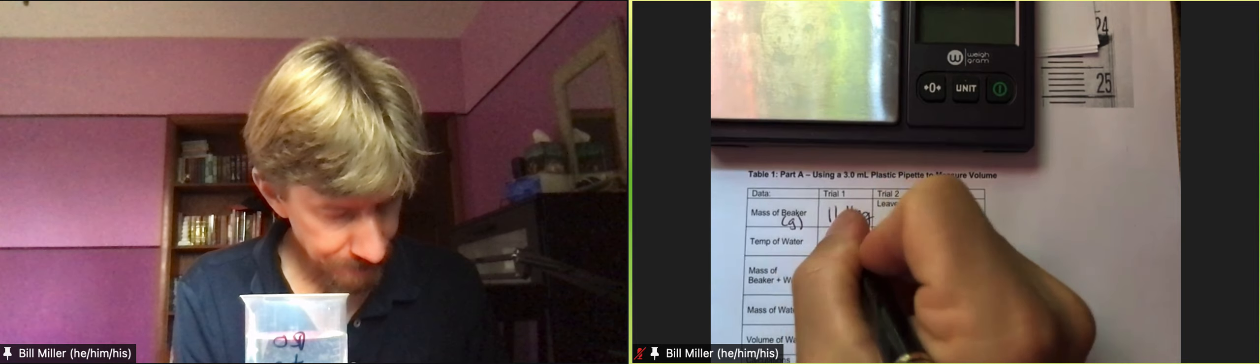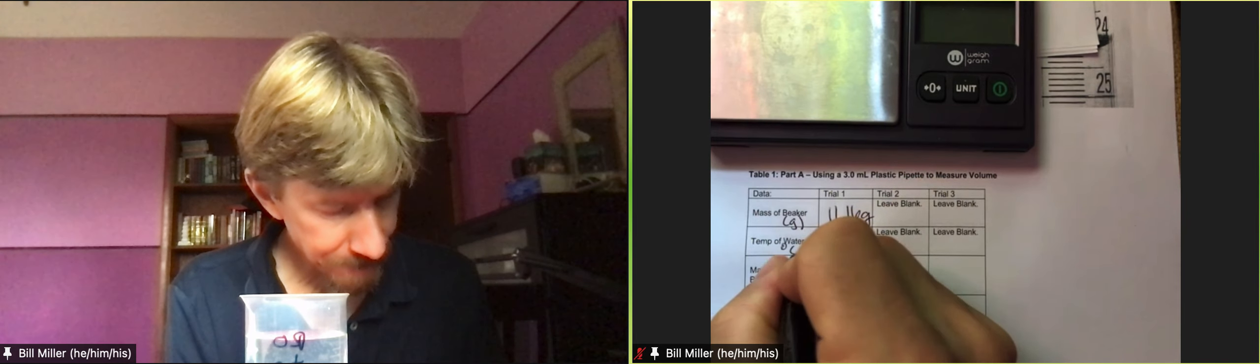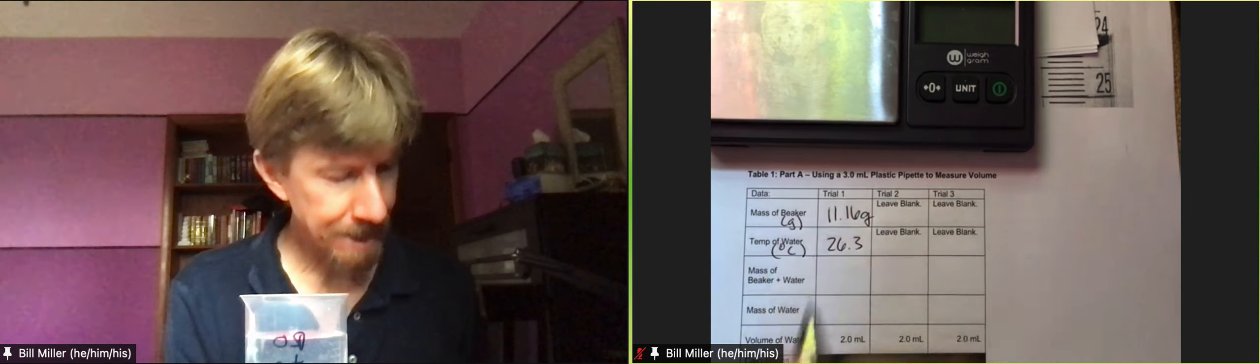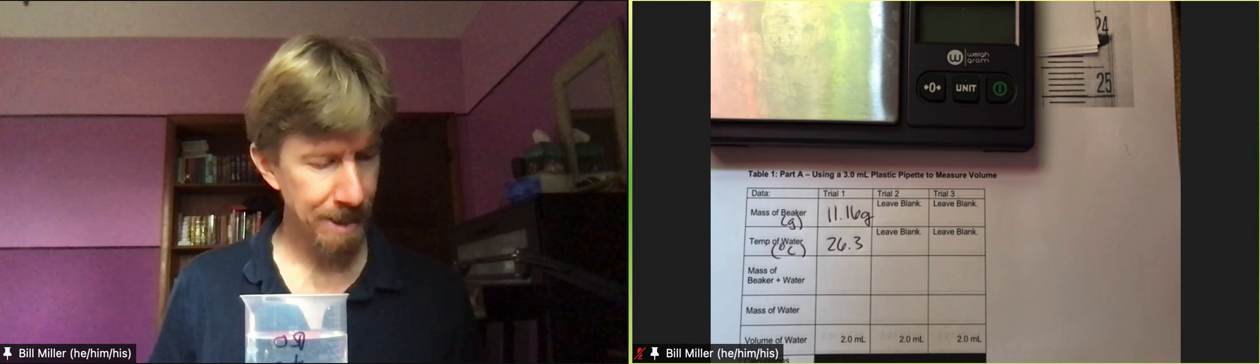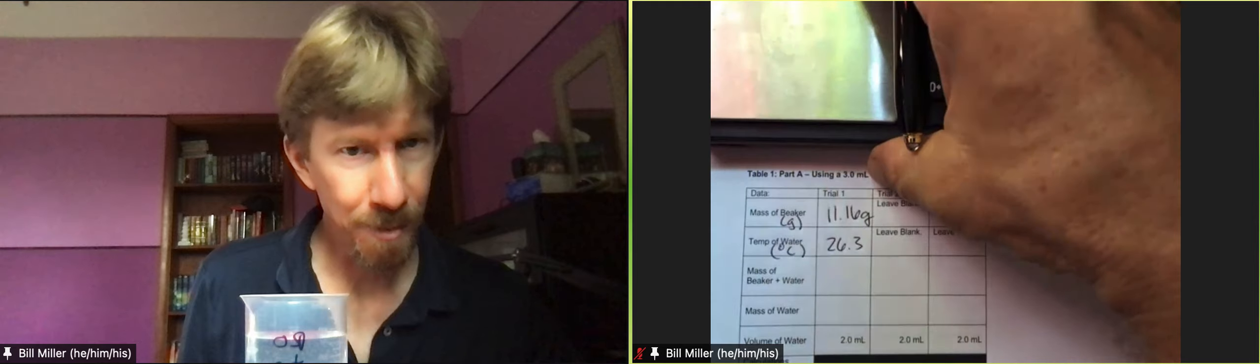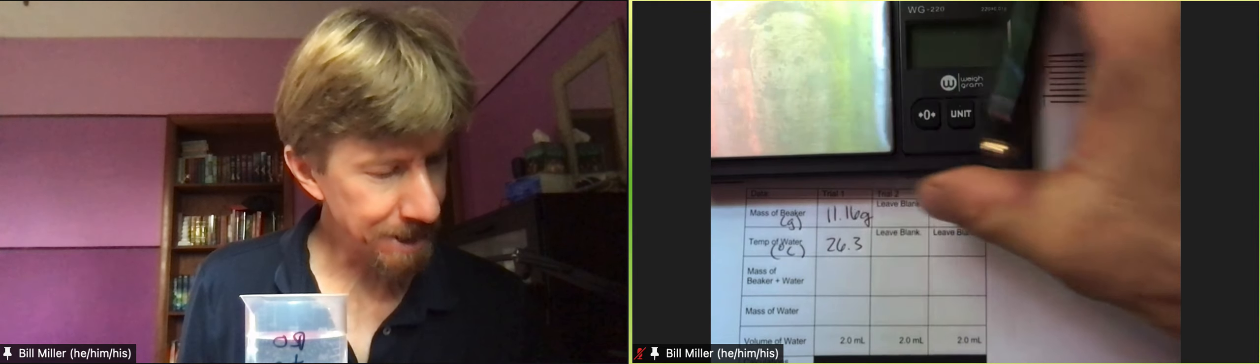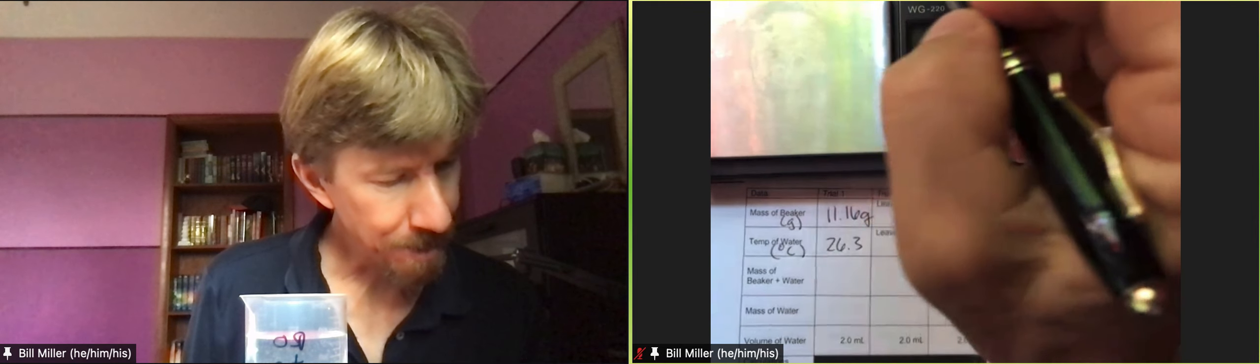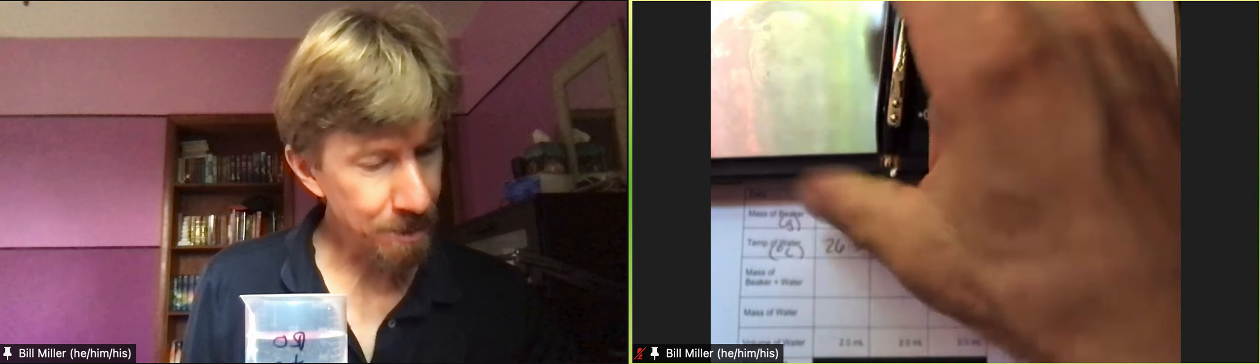If it says something point zero you still write the zero down. 26.3 degrees, I'm going to give it a shake, set it down, write the temperature 26.3 degrees and these are going to be degrees Celsius. All right so following along in our procedure we just did number two, record the mass, record the temperature, we just did number three.